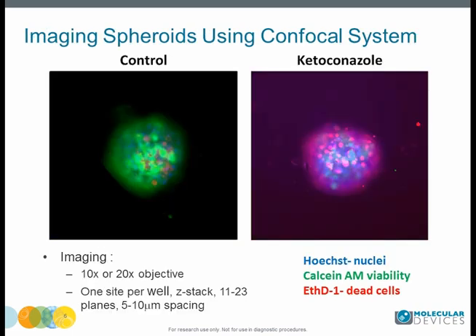Common issues for 3D imaging described by others include efficiency of light penetration into a dense object like spheroids, also light scattering by cells and high background from out-of-plane fluorescence. These issues tend to be less important for smaller spheroids, like those used in the present study. Confocal microscopy provides efficient background rejection and sharper images.